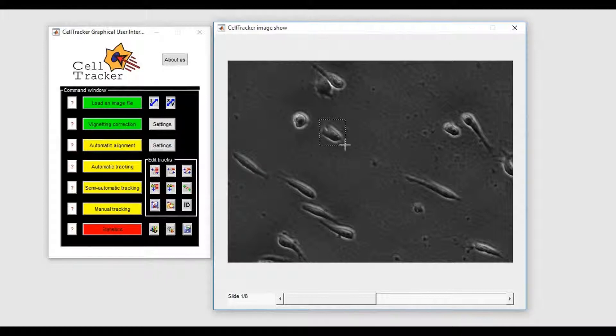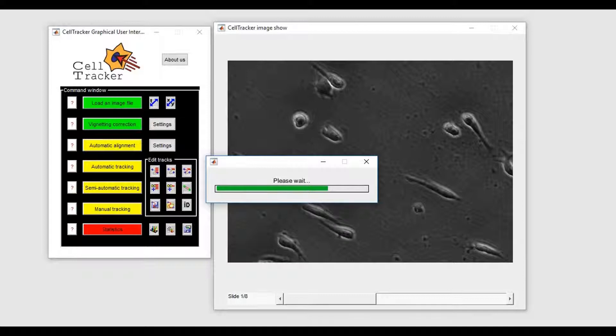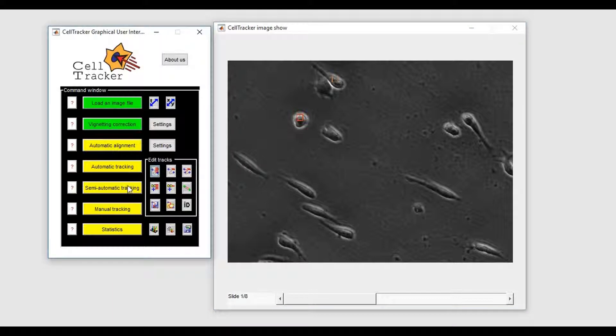We have to define a template of a representative cell by drawing a rectangle on its image. In this case, only a few cells have been correctly tracked. This means that the parameter set for the cell detector threshold is too high.